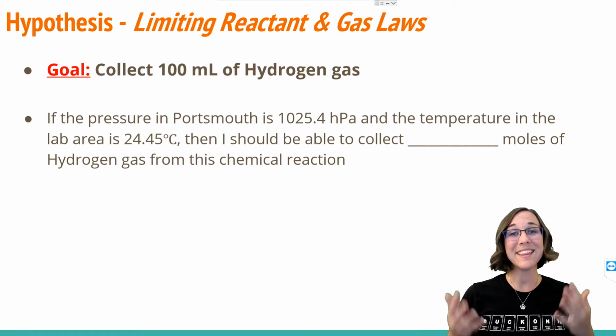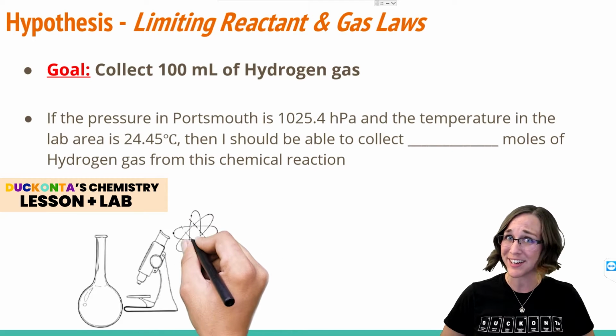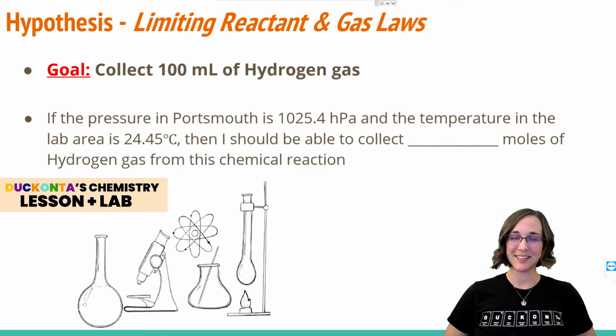Welcome to the flock. Let's dive into this lesson and lab where we're going to collect hydrogen gas and then, of course, set it on fire because it's super flammable and awesome, and then do some calculations for that gas we've collected. Stick around to see how it's done.